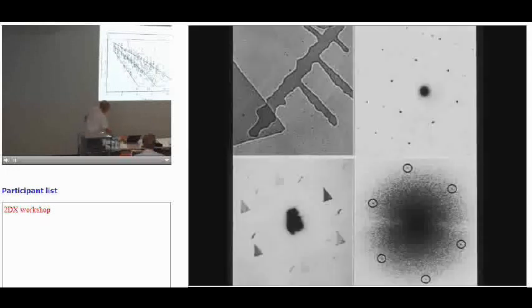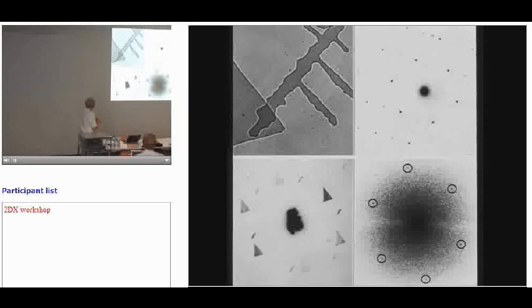And so what we've done is to work with paraffin. And so here is a 2D crystal. This is paraffin on one side of the carbon, paraffin on the other side of the carbon. This is an early one, Bob Glaser, when he came on that year of sabbatical. That's a demagnified image. That's an electron diffraction pattern. These spots are at sort of 3.7, 4.1 angstroms. So this first spot in paraffin is basically at the same resolution as the last spot that you'd be happy with in X-ray. So it's a very good sample. And these spots here are 1% of the intensity of the direct beam, 10% of the amplitude.